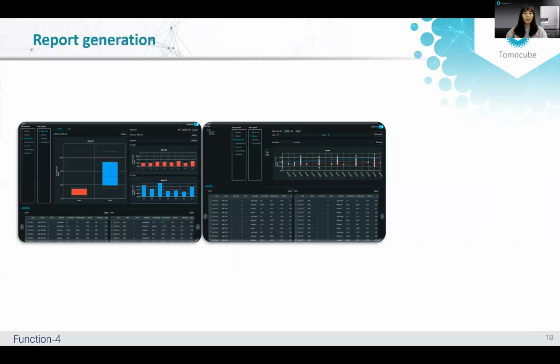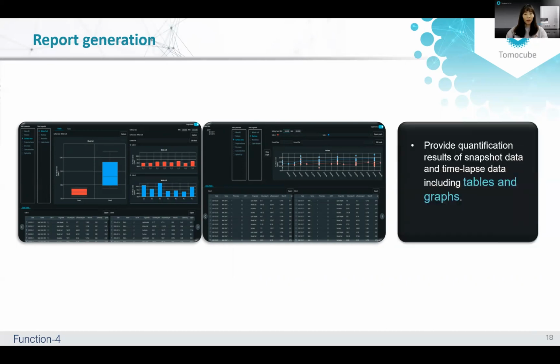The batch analysis result is a significant amount of numerical results. But using TomoAnalysis, you can check the tendency of each group at once on a graph. A graph can be a very useful tool for checking experimental results immediately after analysis.